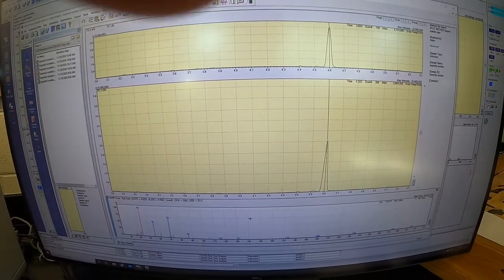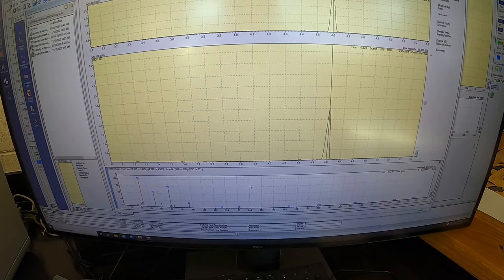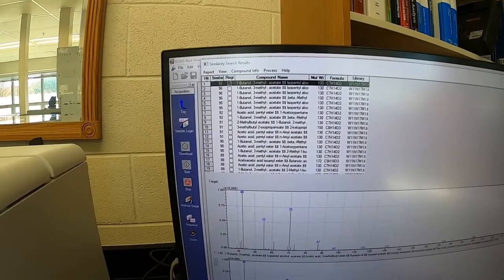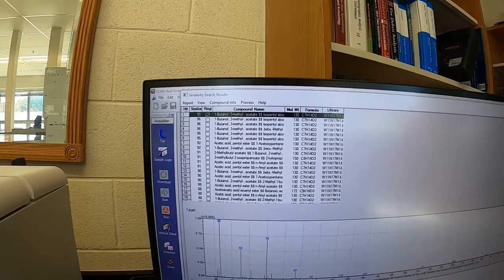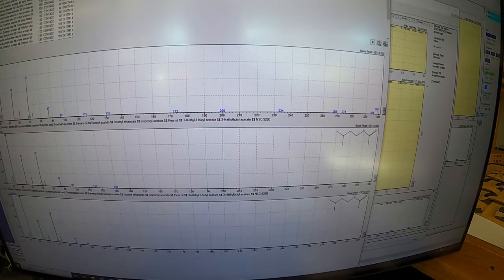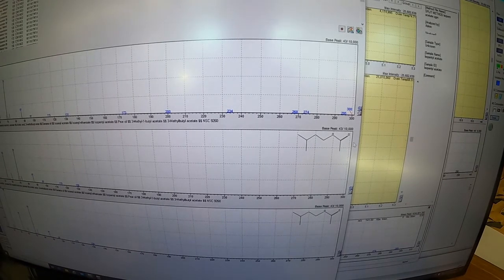If you look in the bottom of the screen, the long box here shows the mass spectrum, and you can see all the different fragments. And if I right click and do what's called a similarity search, now what it shows me is pretty good chance. In this case, the similarity search is showing 98% chance that my compound is 1-butanol 3-methyl acetate, which is in essence isopentyl acetate. So if you look down here, you can see the structure of the library match being isopentyl acetate. So that's a good thing.